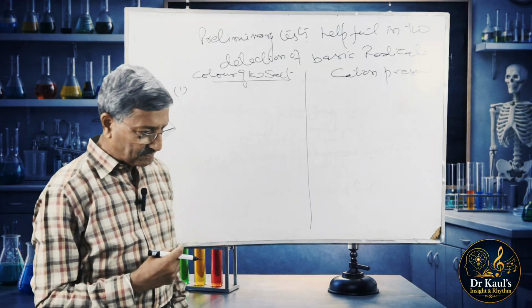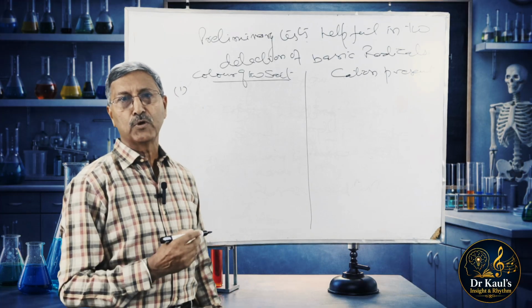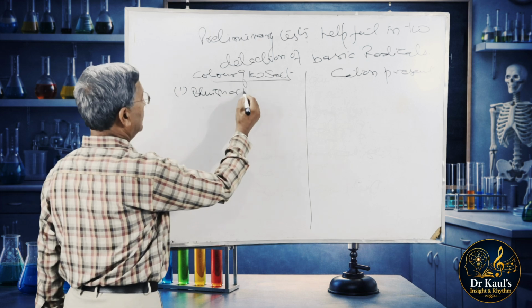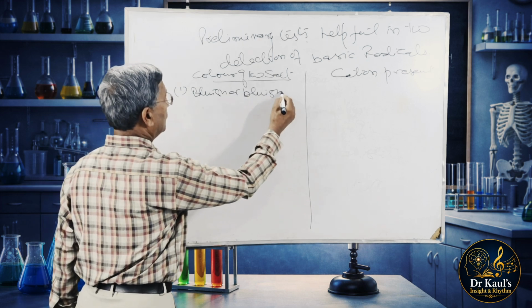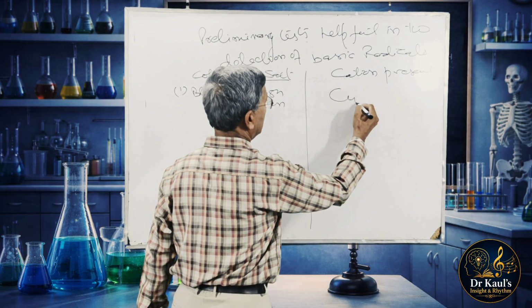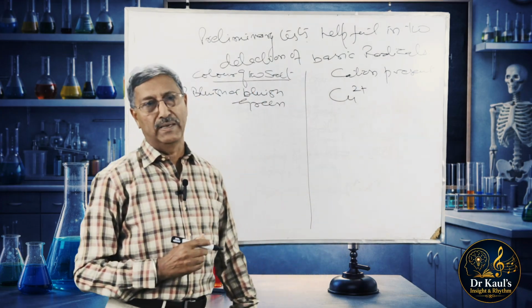First of all, if the salt is bluish or bluish green, it indicates the presence of Cu2+, that is a cupric ion.